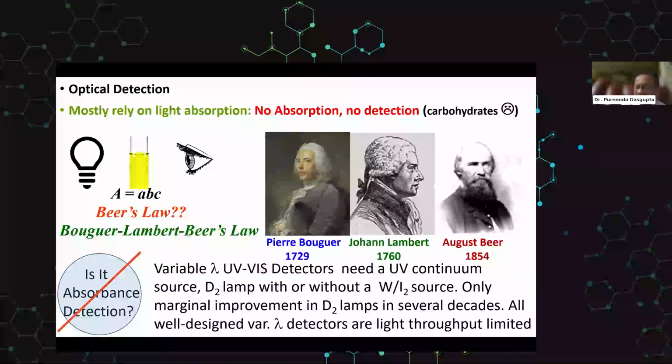So that's the contribution of Beer to Bouguer-Lambert-Beer's law. So the moral of the story is, if you want to be famous, get a 4-letter word as your name. Okay? So Foster, too bad. Too late for you. At any rate, the American Society of Metrology says this is what you should say, Bouguer-Lambert-Beer's law.